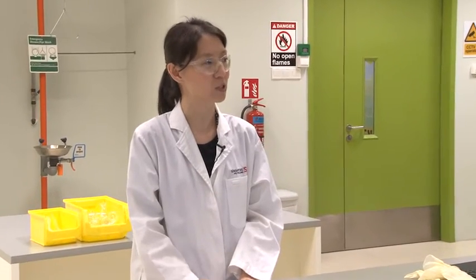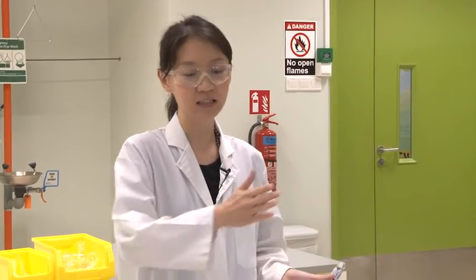In experiment 3, what are the important aspects of a kinetics experiment that you have learned or you can recall? Concentration of a reactant. But in terms of your techniques, what do you need to take special precautions? How you perform? Remember what was the last kinetic experiment? At regular intervals, you take out aliquots, right? So you repeatedly perform a particular technique, right? And then you quench. So what was the thing that you need to take note of?